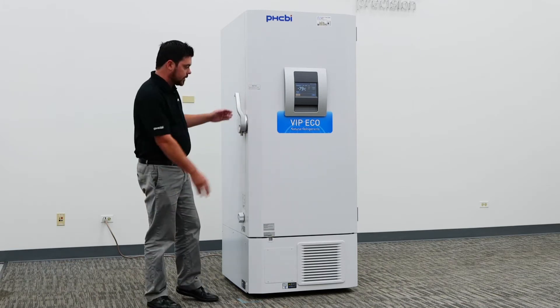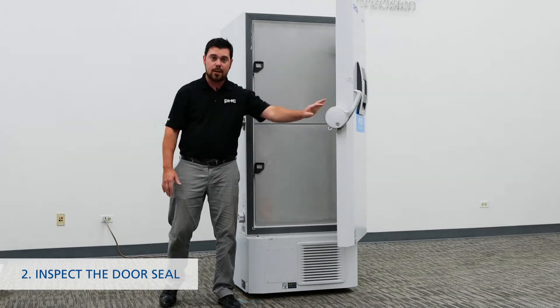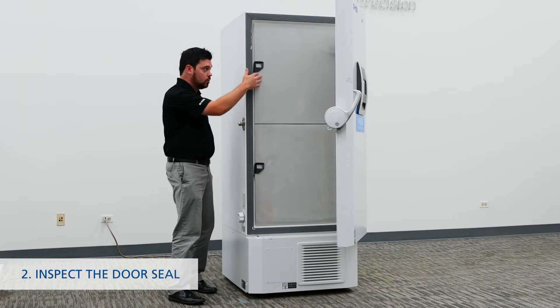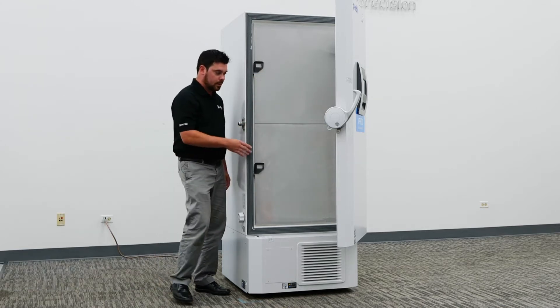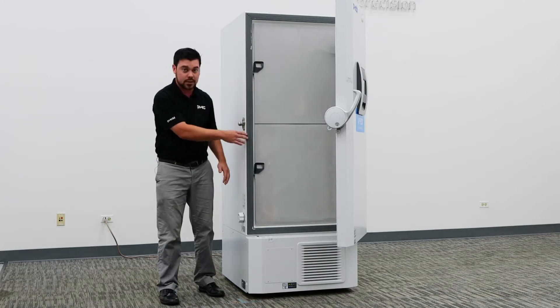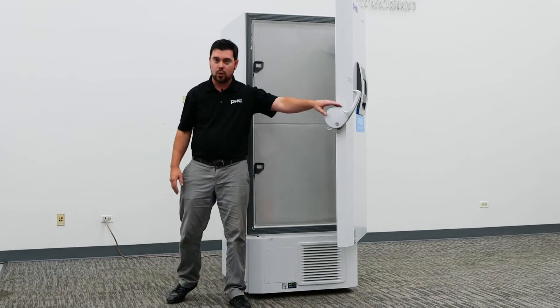The next step is making sure that you have an adequate seal all across your outer door. This will also apply to your two, four, or five inner door options depending on the model that you have. You want to verify that there are no debris or any cuts or nicks inside the gasket, which will prevent the outer door or inner door from sealing properly.